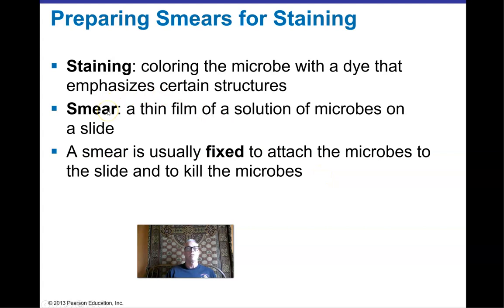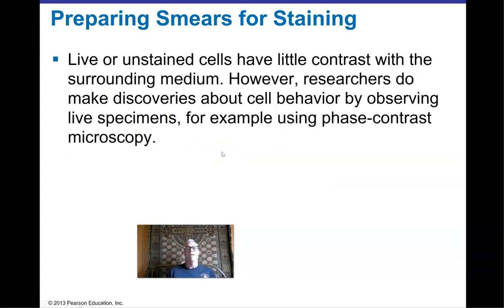So first you make a nice smear, and then you fix it, and then we're going to stain it with something to make it have some contrast.